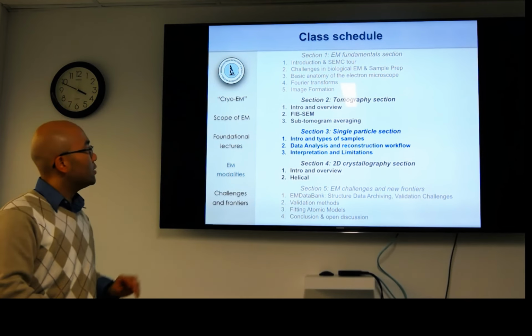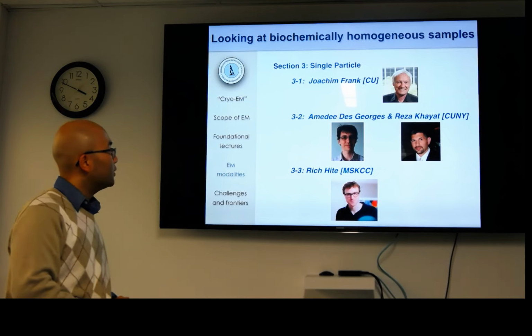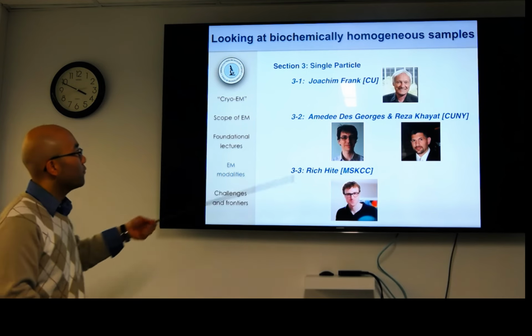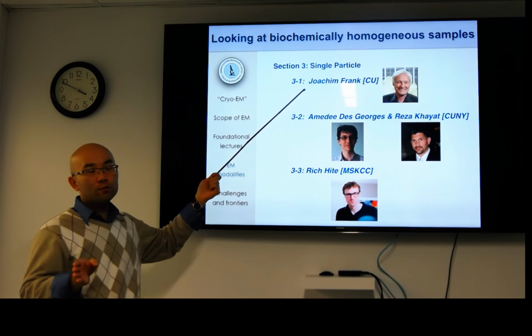The next modality we go into is single particle. The slide I showed a little bit before was about Nature Methods. I think I have that slide coming up. The team of teachers that are teaching that is Joachim Frank. He's written a very good textbook. If you look on our webpage, we reference that as a very good textbook if you want to learn about EM.